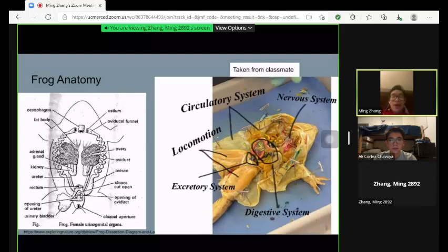Speaking of reproduction, the cloaca is a key component of it as well. In the picture of a dissected frog, we are not able to cleanly make out their sex or reproductive organs. Only the cloaca can be somewhat made out. Therefore, we refer to a source online for this part. In a female frog, the reproductive organs are kept around their belly. The fertilization process of a frog egg occurs outside, so the female lays the eggs through the cloaca and the male fertilizes them afterwards.